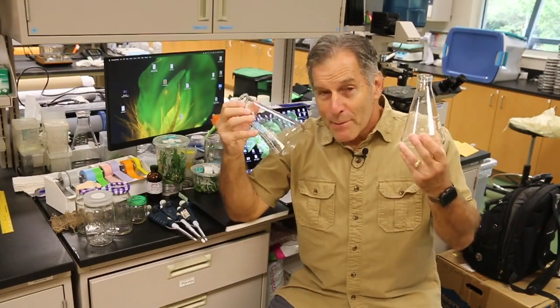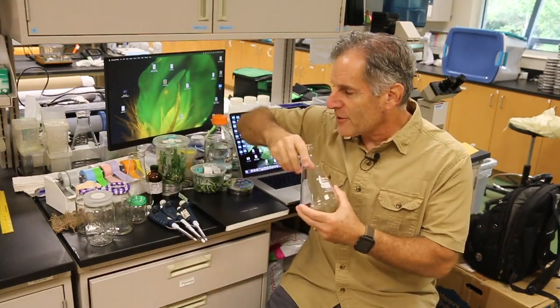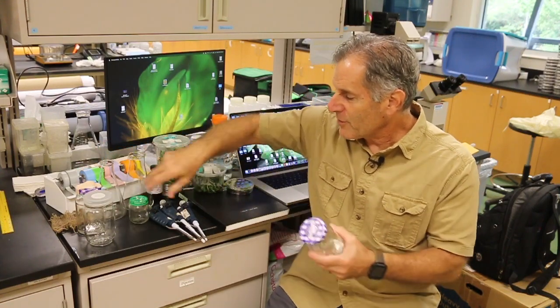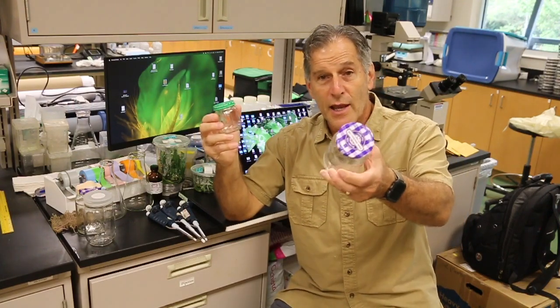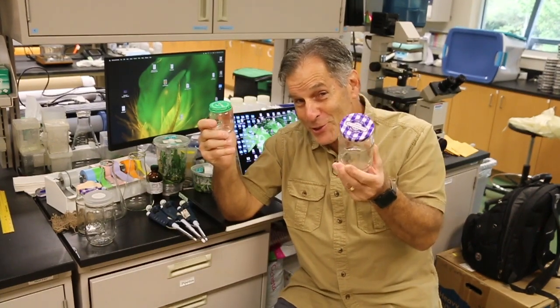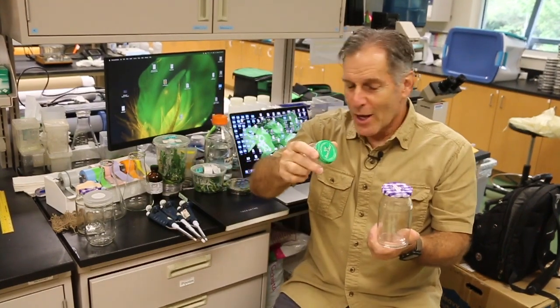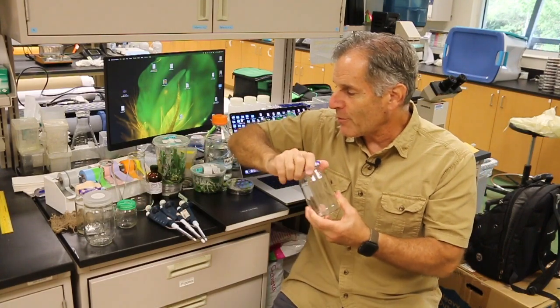Now, people don't use these containers anymore. If you're going to use glass, people use, here's a baby food jar. This is glass. Here is another glass. So this is a jam and jelly container. And I got to show this, if you know this. I'm showing this because the plant propagator Junior works for this company, not in the jam and jelly division anymore, but she works in this company.